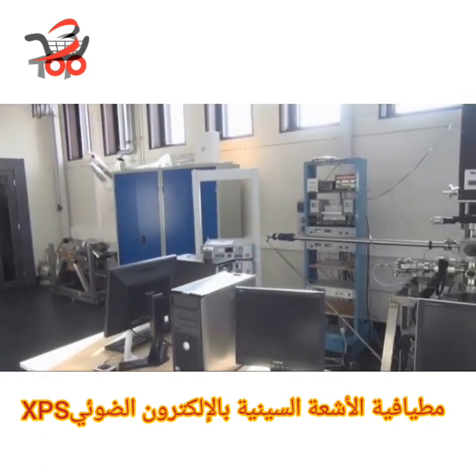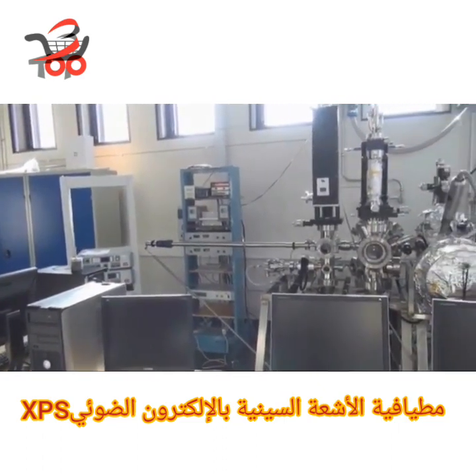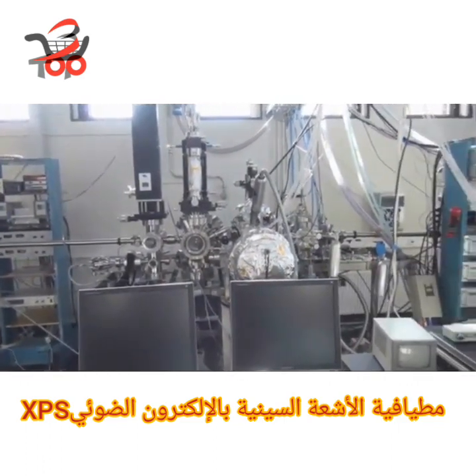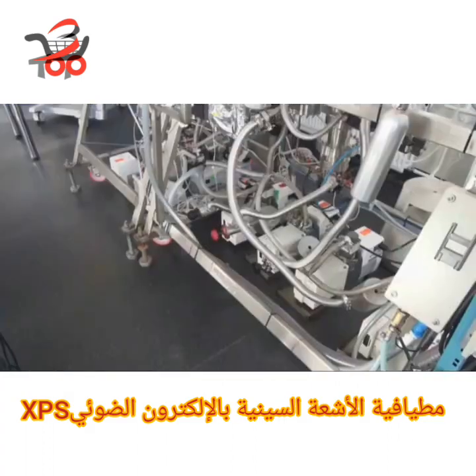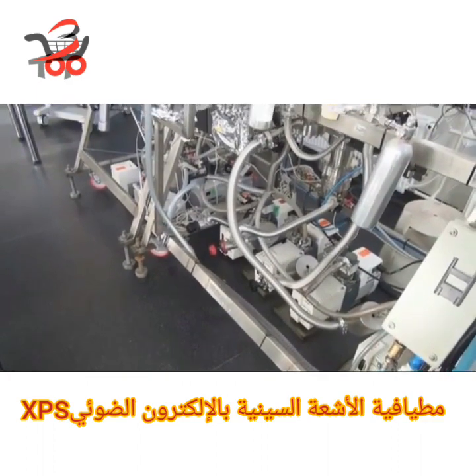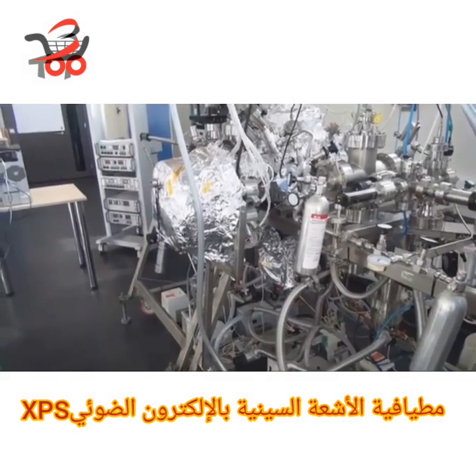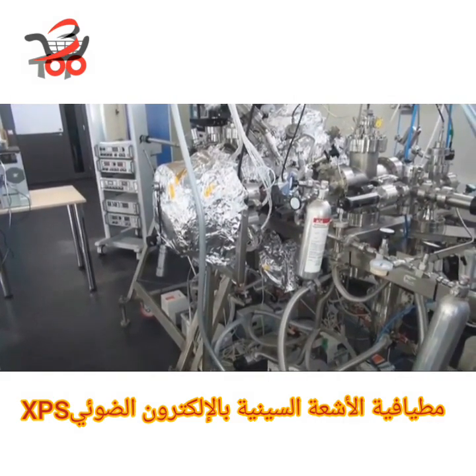Now this marvelous piece of engineering is a real X-ray photoelectron spectrometer used for surface studies in the Institute of Physics in the University of Tartu. It operates in ultra-high vacuum of 10⁻¹⁰ millibar, which is obtained by combining oil-based rotary pre-vacuum pumps, a turbomolecular high vacuum pump, and finally an ion pump for ultra-high vacuum.